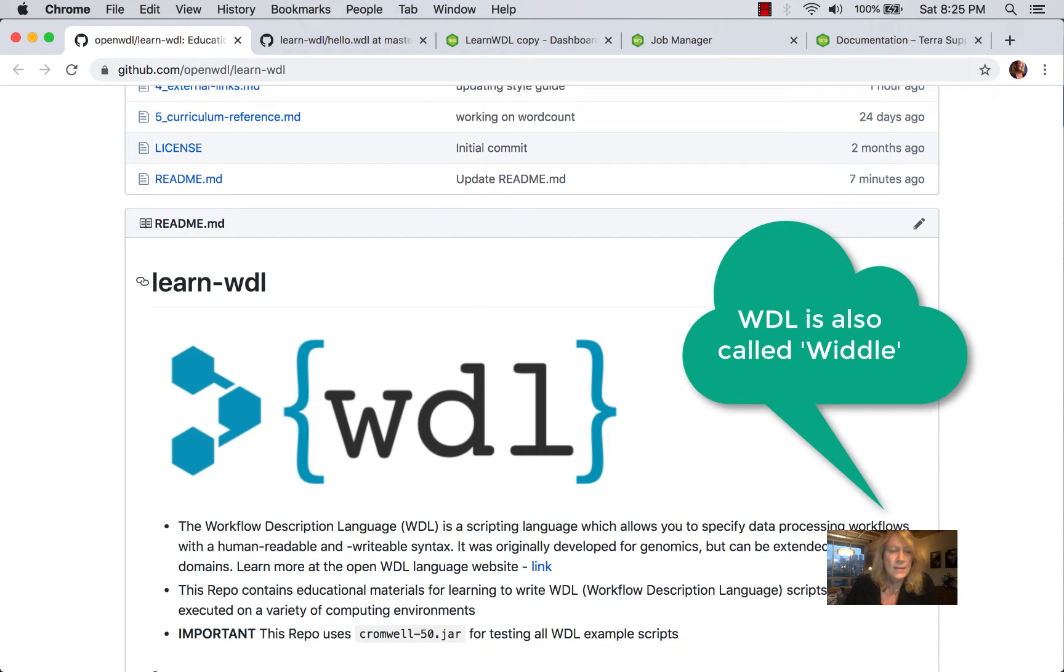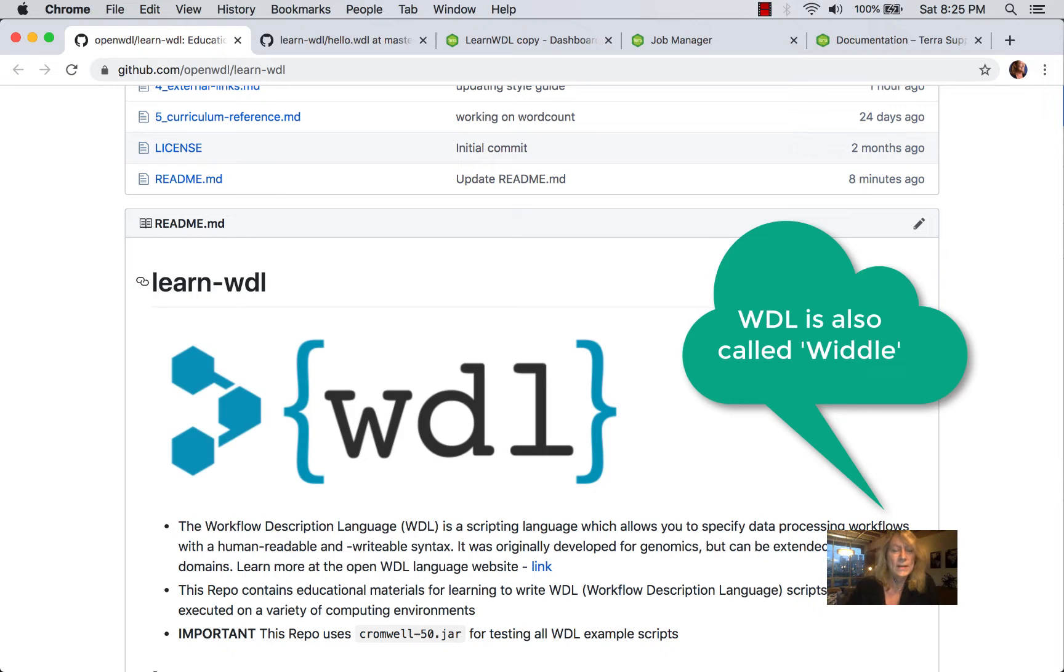So this course is going to provide you with a number of examples of working with WDL scripts. And as is typical, we're going to start with a Hello World.